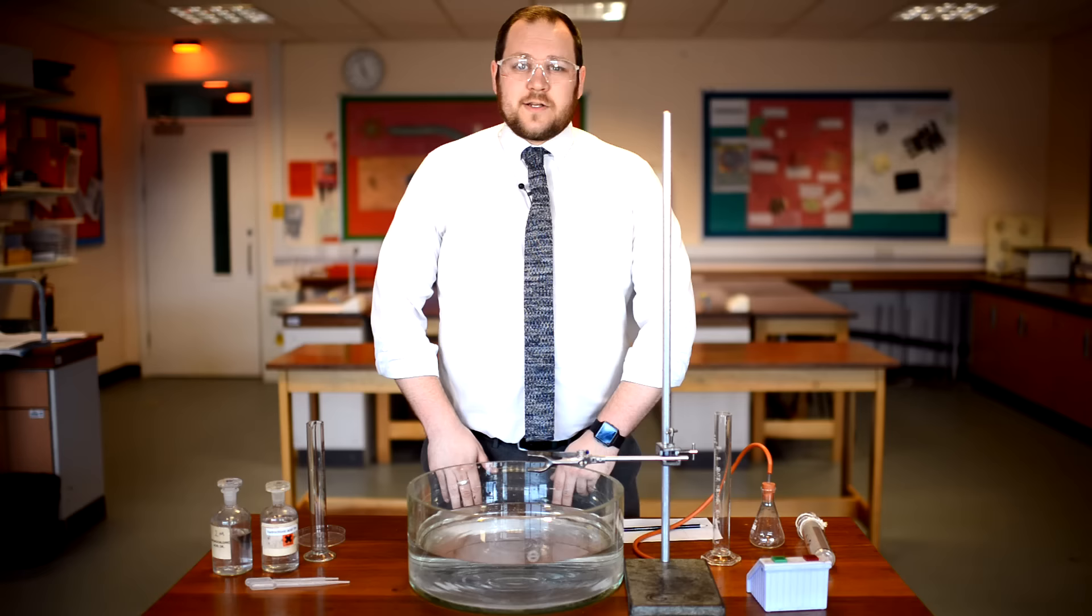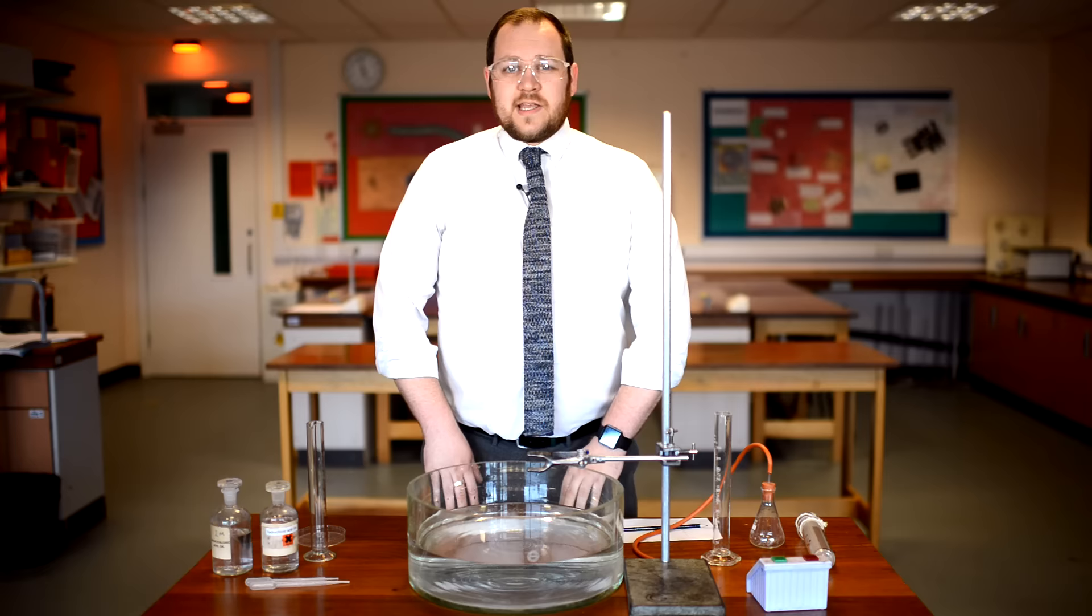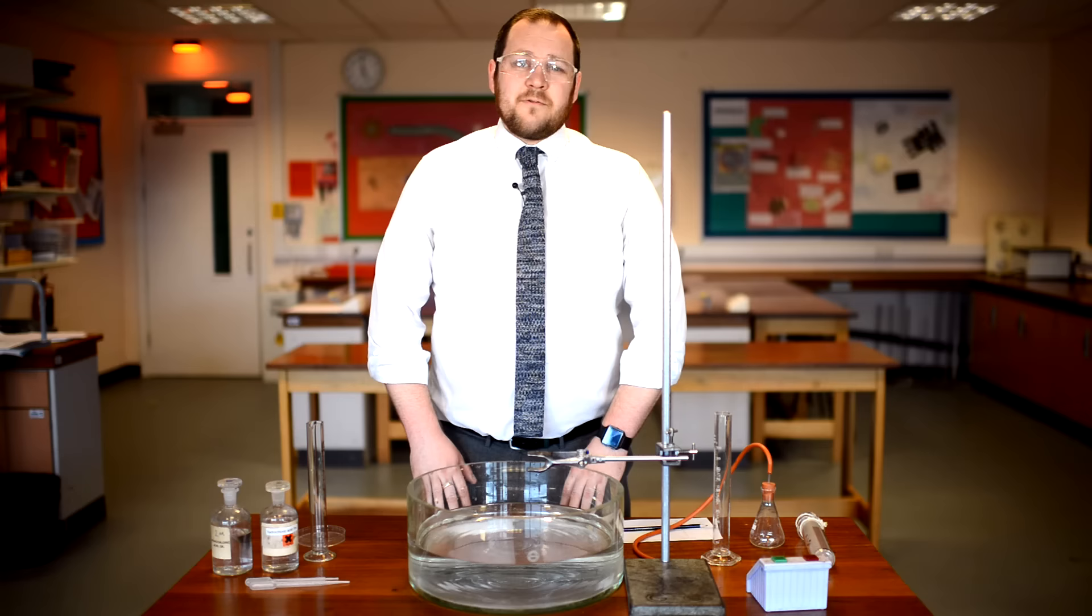I'm going to show you two methods to measure the rate of a chemical reaction today. Firstly, using a measuring cylinder and secondly, a gas syringe. For the reaction today, I'm going to be using magnesium and hydrochloric acid. I'm going to be comparing two different concentrations of hydrochloric acid.